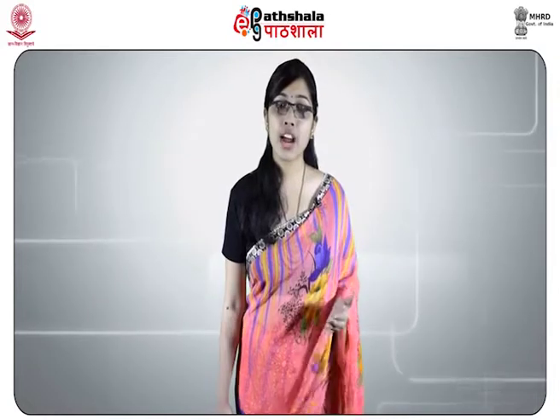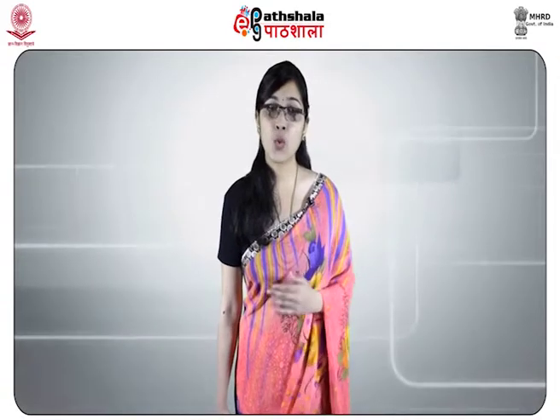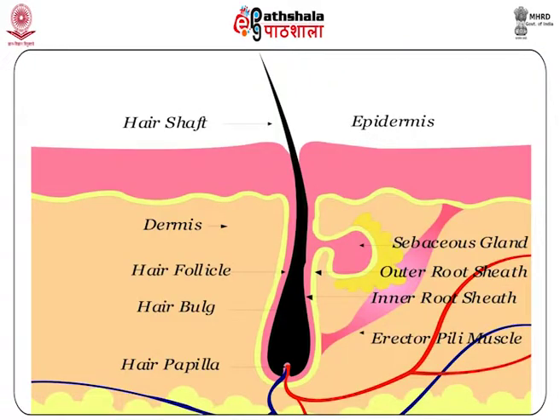They reveal whether the hair has been pulled out or not, whether it has been cut, and if so, when it was last cut. When tips are freshly cut, they have sharp cut ends. With the passage of time, the sharp ends gradually become round. The possible nature of the weapon with which the hair has been severed is also revealed. With blunt weapons, the cut end is found frayed and irregular. With sharp-edged instruments, the cut ends have sharp edges.